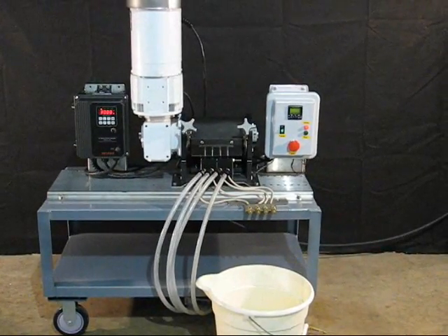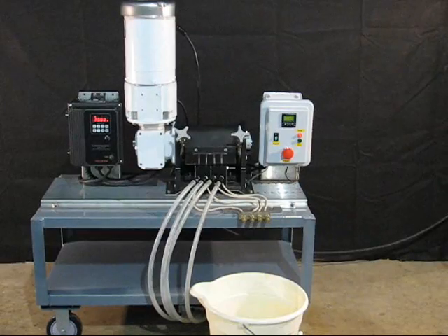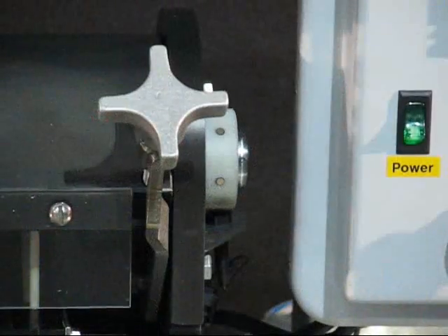The minimum dosing increment for an Accustaltic pump is one-sixth of a revolution, as you see here.